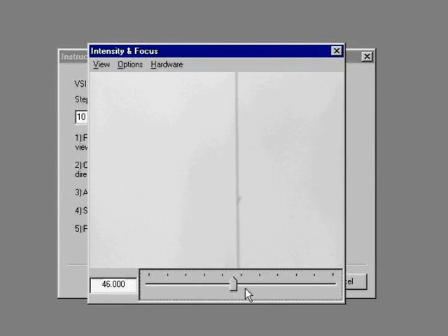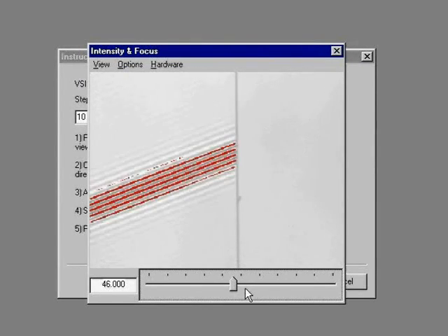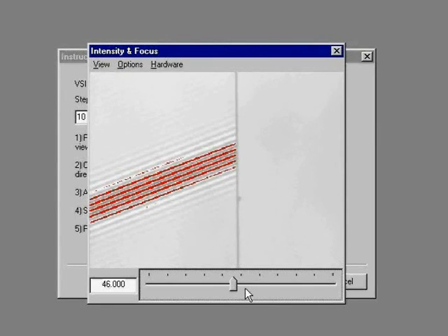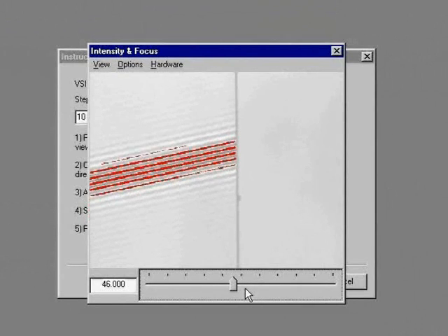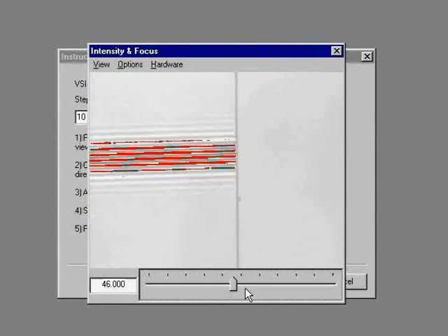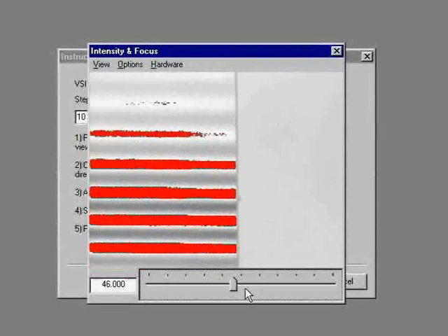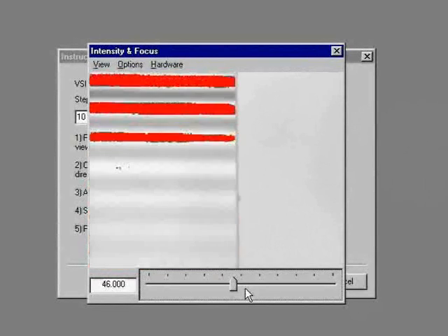Center one side of the step in the window. Move the focus until you can see the fringes. If you are pressing the fast button, the focus is very sensitive, so you must move the knob very slowly. We can rotate the fringes by pressing the tilt tip button and moving the joystick. We tilt the fringes until they are perpendicular to the step and until we have 2 to 4 fringes in the field of view.